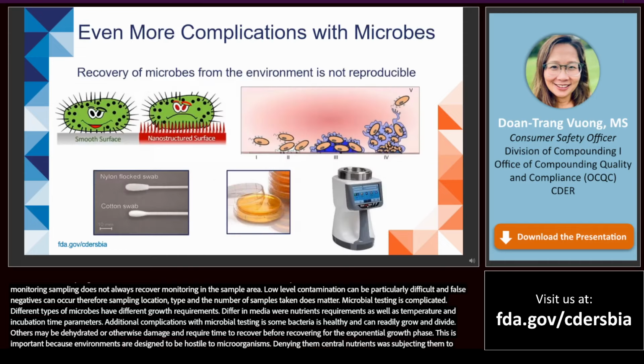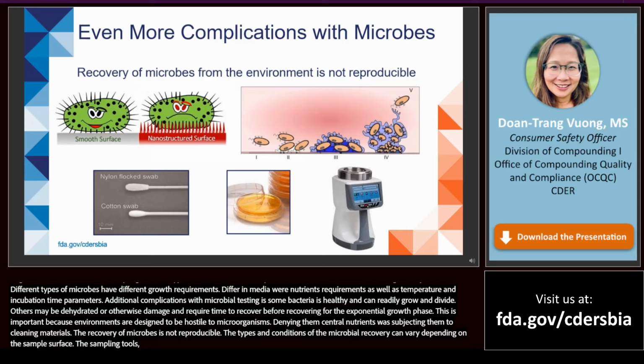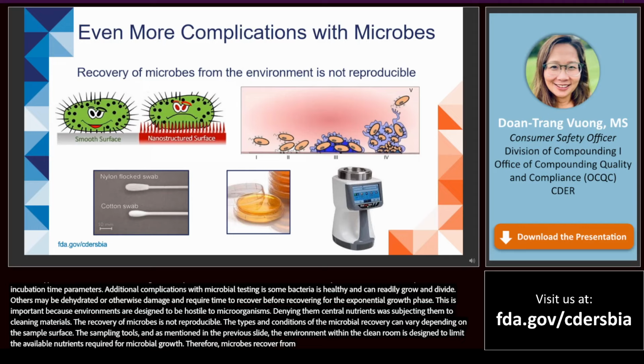Even more complication with microbes: the recovery of microbes from the environment is not reproducible. The types and conditions of the microbial recovery can vary depending on the sample surface, the sampling tools, and, as mentioned in the previous slide, the environment within the clean rooms is designed to limit the available nutrients required for microbial growth. Therefore, microbes recovered from environmental sampling often are nutrient-starved.